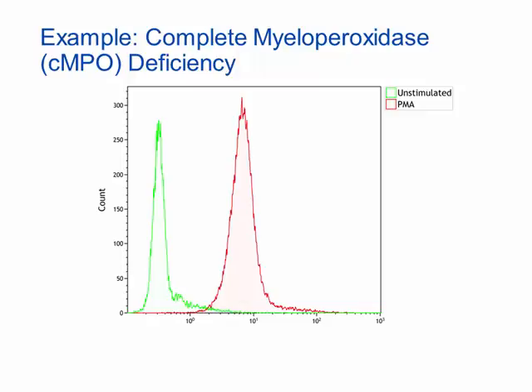The DHR results can give false positives if there is complete myeloperoxidase deficiency. In complete myeloperoxidase deficiency, there is a shift of the PMA-stimulated histogram marked by the red line. Patients with complete myeloperoxidase deficiency are usually asymptomatic, but approximately 5% can have significant infections, often in the context of diabetes.